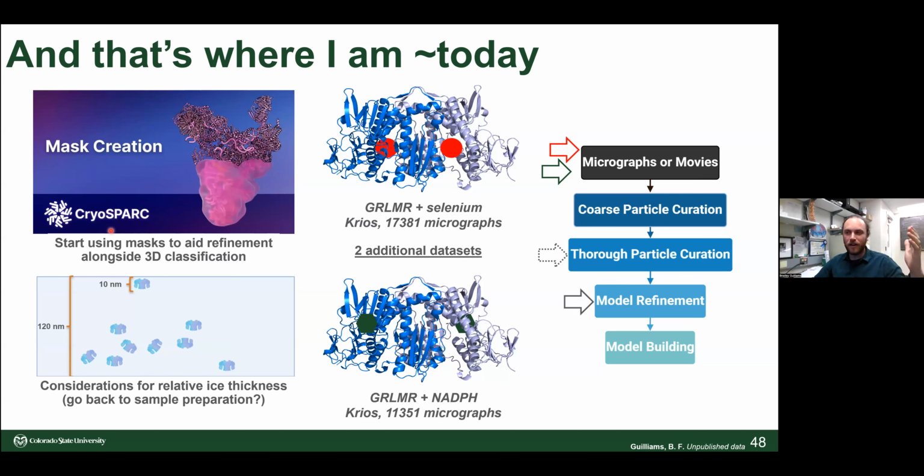I mentioned a while ago these dimer of dimers, and I should have thrown it up here, right? But I'm thinking that a lot of these second particles, the density is getting included, and it's maybe trying to align somewhere in between these two particles, as opposed to just aligning with one. So I'm going to play around with masks with a single particle. That's where I'm going next. Any other advice? Again, happy to learn from those that are more experienced, right? But I am learning this as I go. We're not a lab that does single particle cryo-EM, but I've had a lot of fun with it.